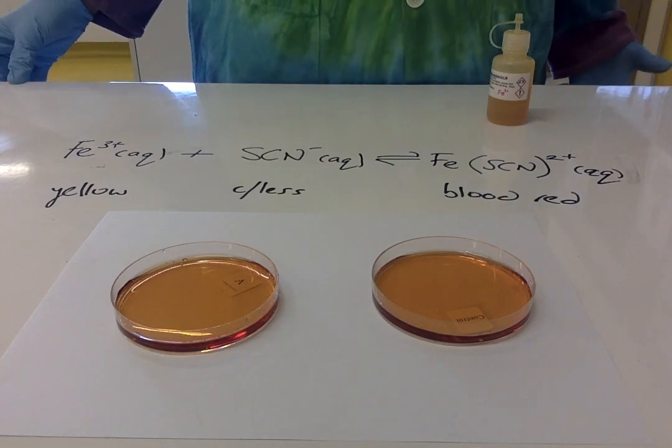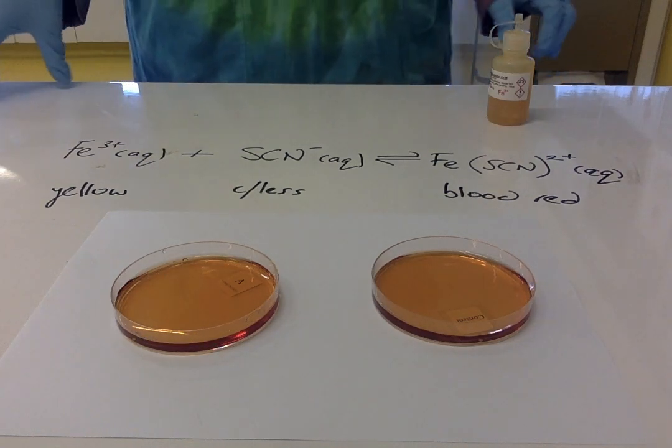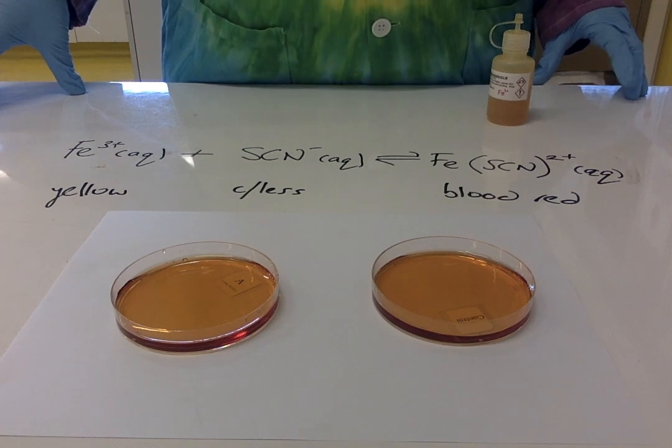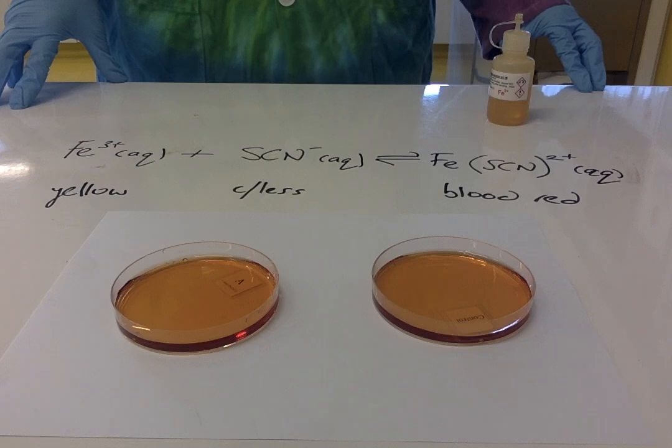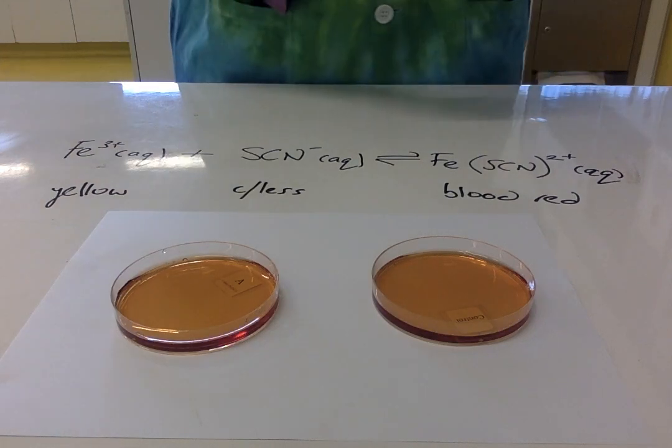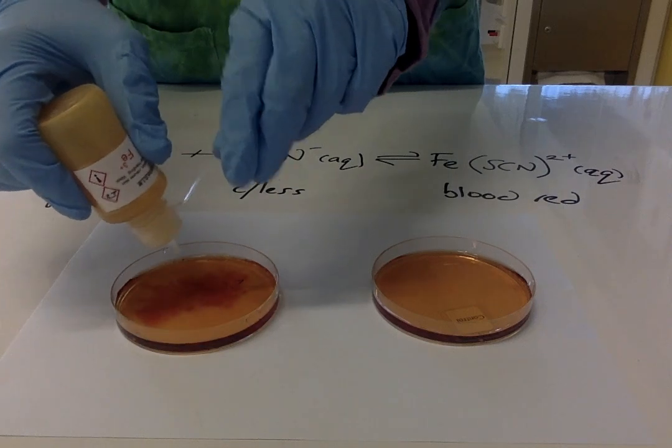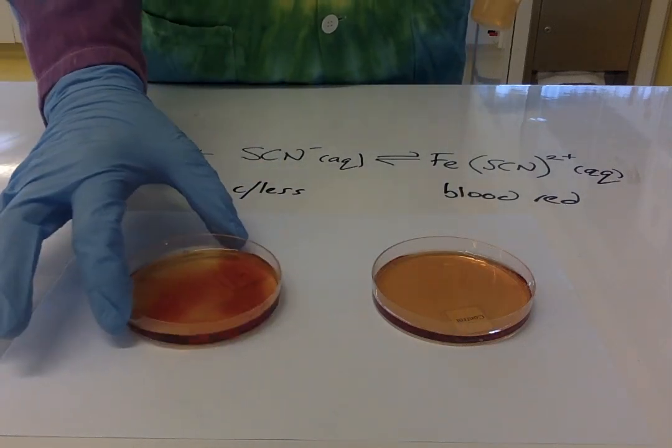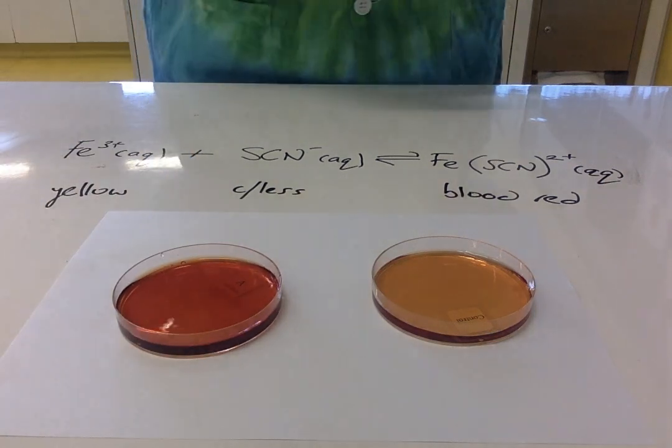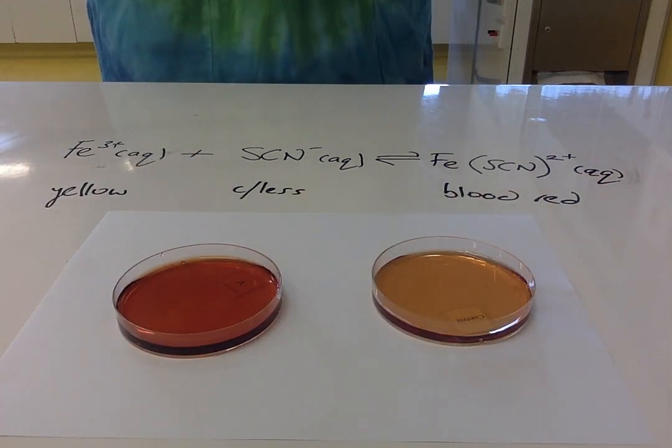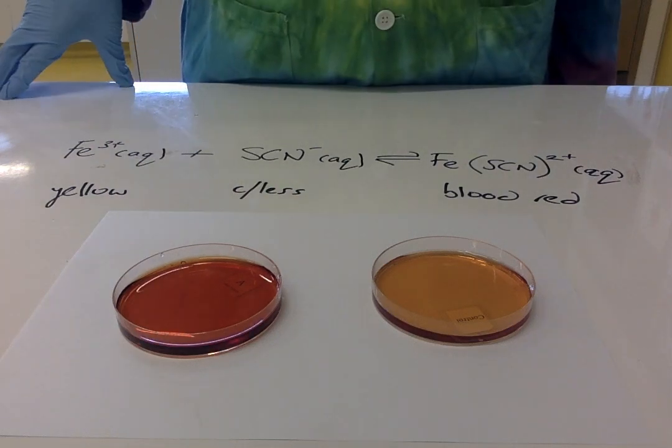One of these will act as a control. The first test I'm going to do is add some iron nitrate, so in effect I'm adding Fe3+. What you can see happen there is the color has gone distinctly darker, so that's resulted in an equilibrium shift to the right to use up those extra Fe3+ ions.